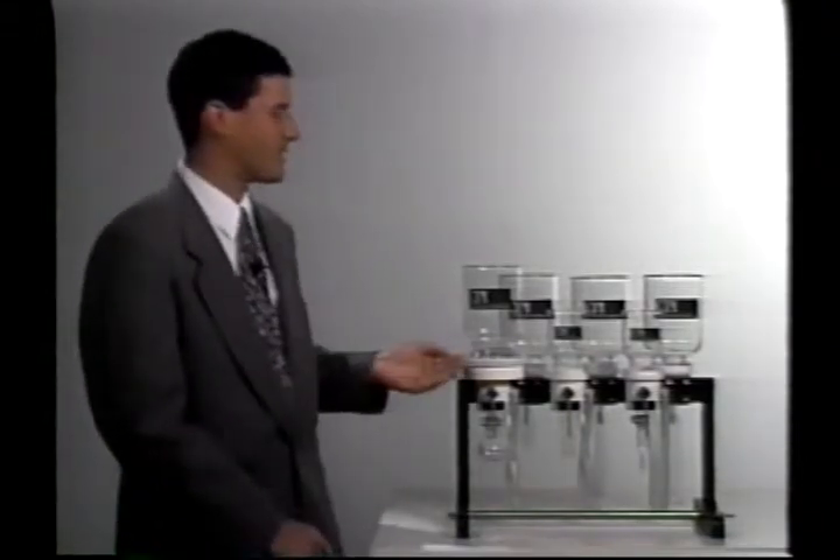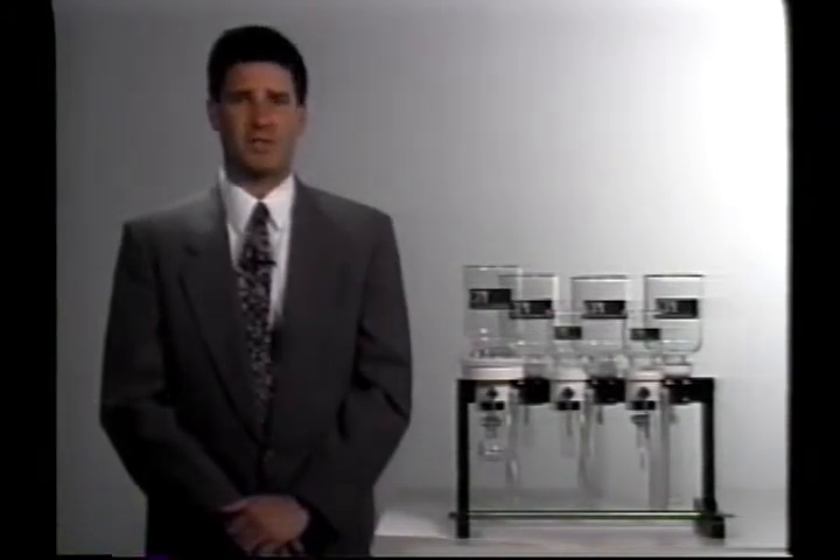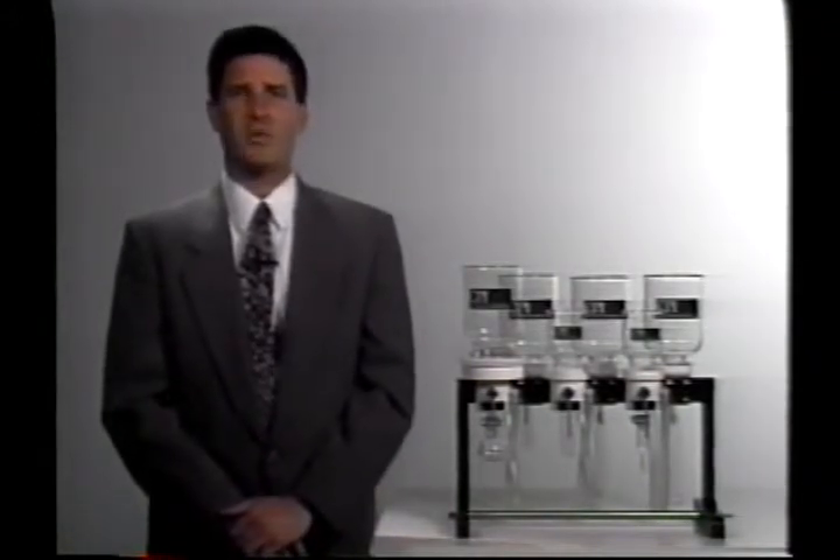Hi, I'm Matt Noworski of CPI, and thank you very much for taking the time to watch this video. I'm truly excited to get the opportunity to introduce you to CPI's MultiPrep 7000 solid phase extraction manifold. I'm also going to talk today a little bit about CPI solid phase extraction discs, and one of our applications chemists will perform an extraction using our discs and our manifolds. He'll review some basic principles of solid phase extraction, as well as share some of his recommendations and advice as far as SPE techniques.